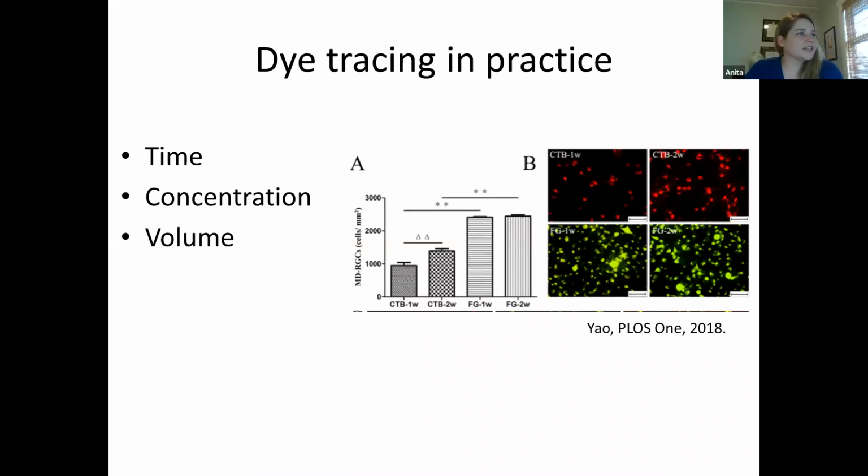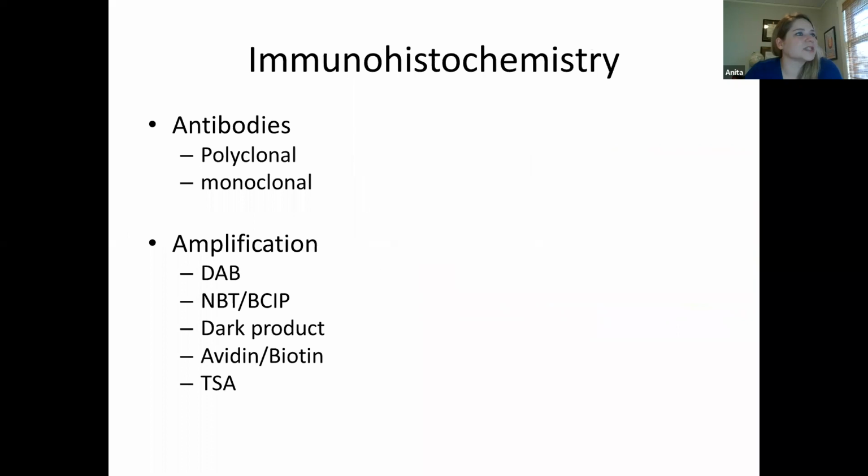Yeah, so I forgot what the other thing I was going to say about using dyes in practice, but basically, you really need to make sure that you don't have precipitation, because then your actual dye is not going to be deposited into the brain.